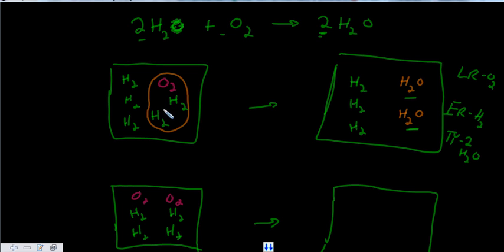In our lab, not knowing how a reaction is balanced, we're going to try to find these coefficients in front of each reactant. And to do that, we're going to see essentially which mixture or which ratio gives the most products formed, okay?